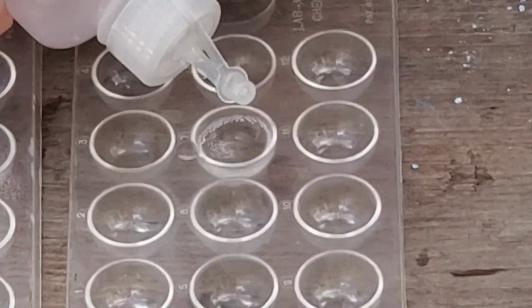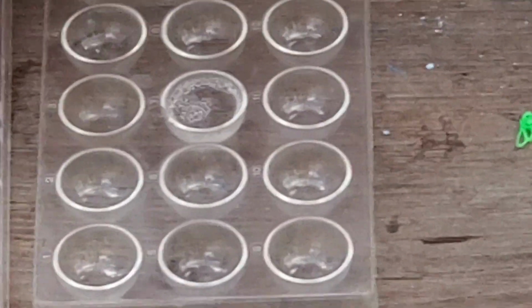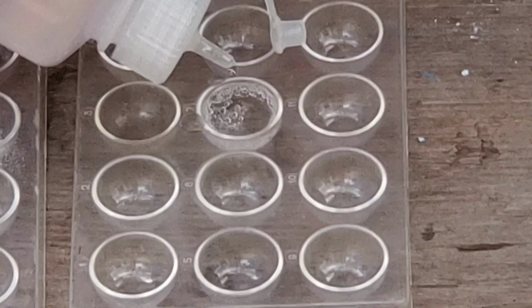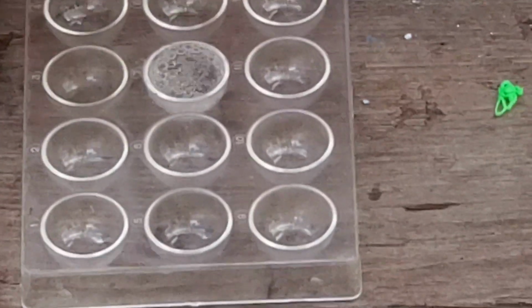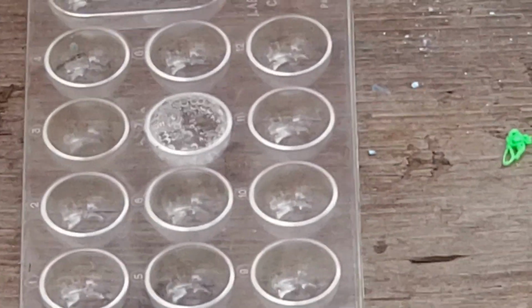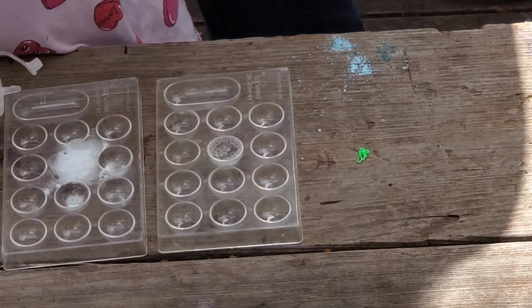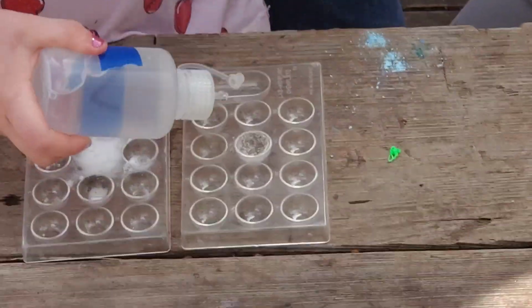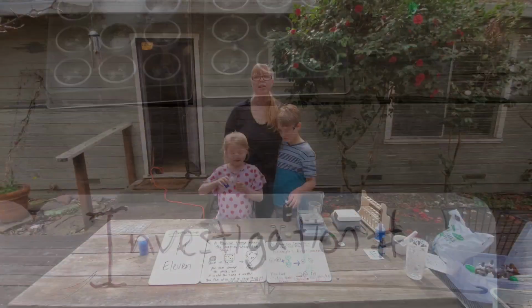Do you see that? Bubbling. You see bubbles? Go ahead, add some more. Almost looks like a soda, doesn't it? Like a little fizzy soda? Okay, that's investigation 10. Those are both liquid still, but then these bubbles come out of that. So that's your qualitative. All right, 9 and 10.